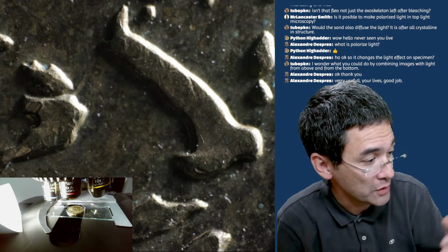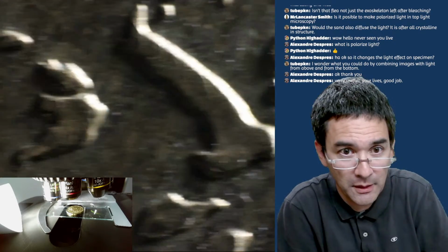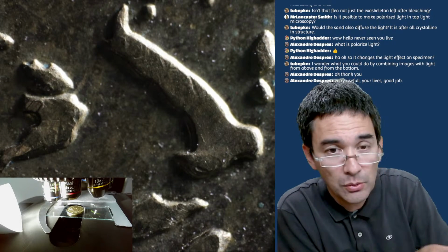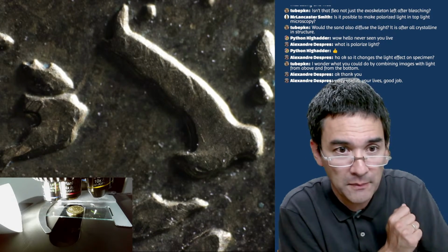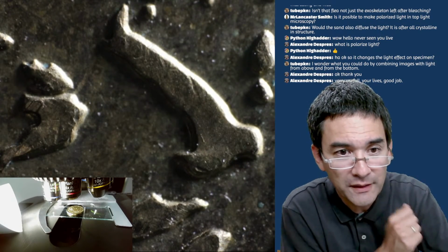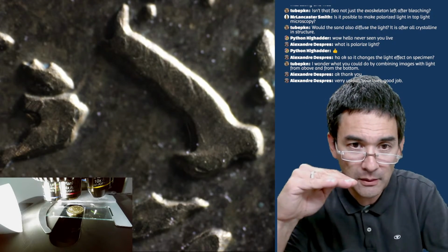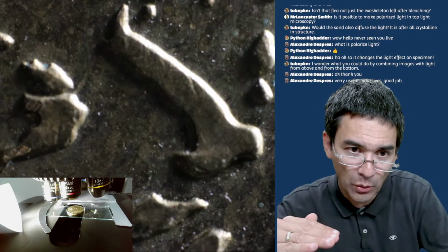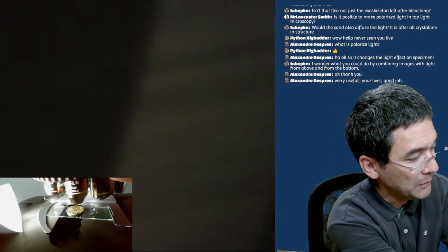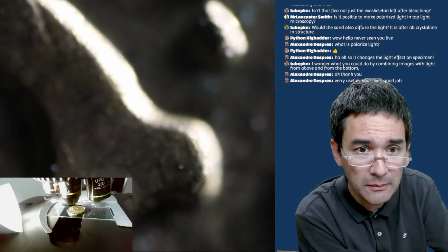But just for playing around a little bit and for observing certain specimens, this is also a viable setup. I want to tell you another thing you might want to try out, and that is so-called image stacking. Especially for thicker specimens, not everything is in focus at the same time. This one is quite nice because the top part of the coin and also the bottom part is more or less in focus at the same time. It's just borderline. But if you go up with the magnification, like right now, it's a little bit dark, I have to tell you, but you should still be able to see it here.